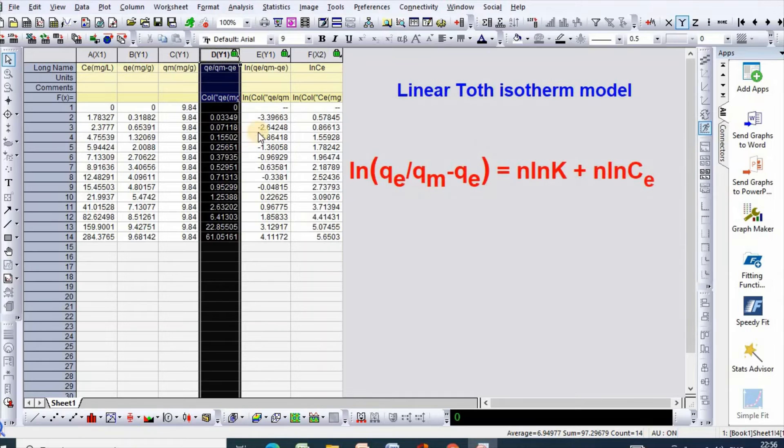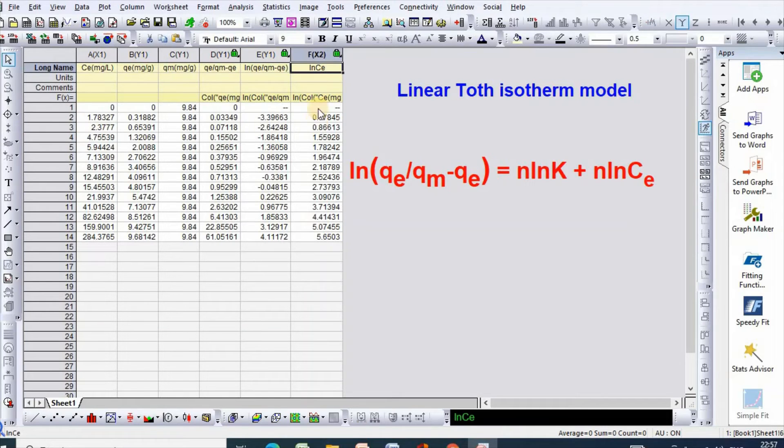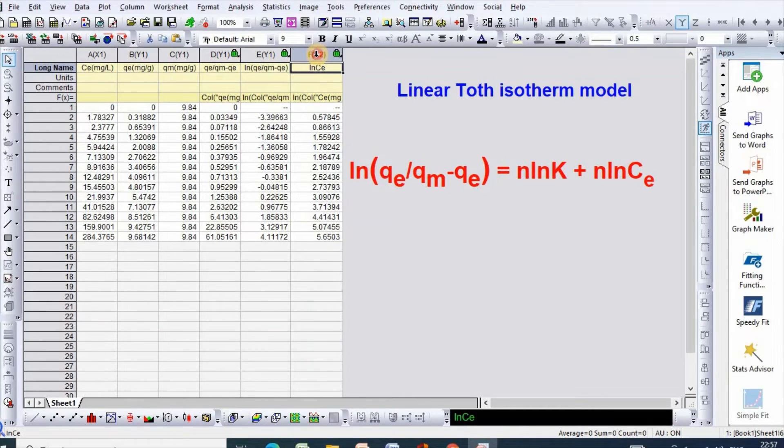Similarly, you also need to convert ln of this and you also need to convert ln(CE) value. And finally, you need to save this as x-axis. I have done so.